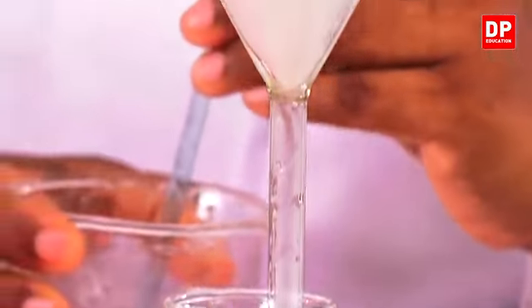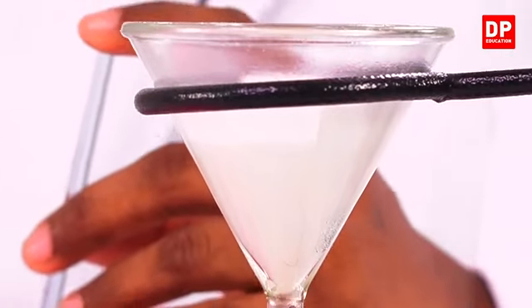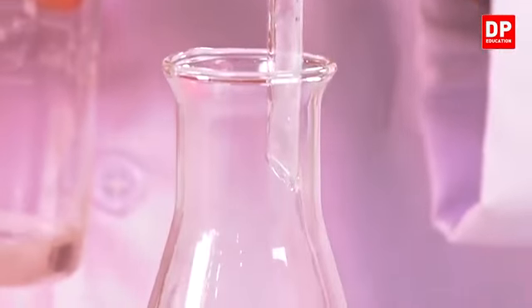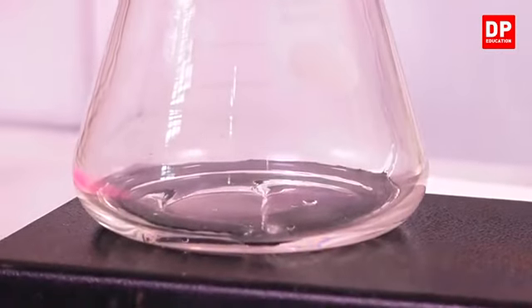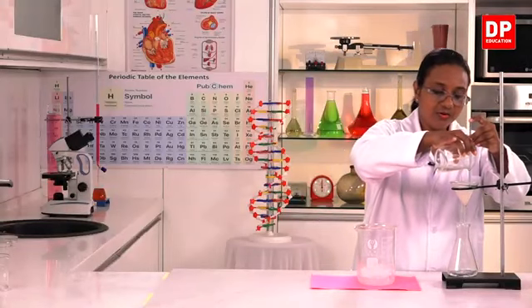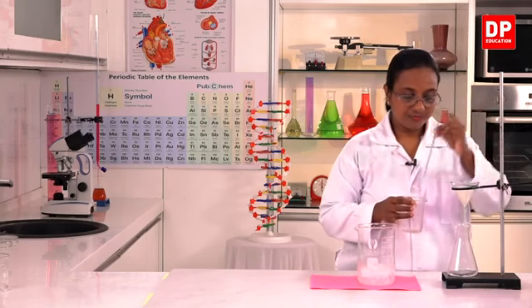So here now the pure sodium chloride solution is getting filtered. Impurities and the salt dissolve in hot water. So whatever cannot pass through the filter paper will remain as the residue. Those are some of the impurities.